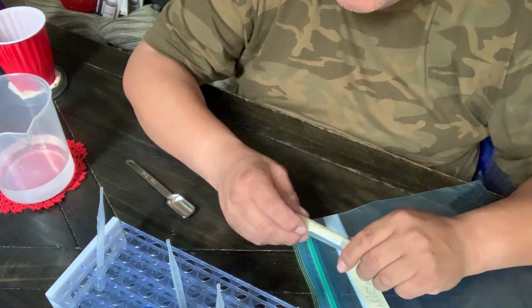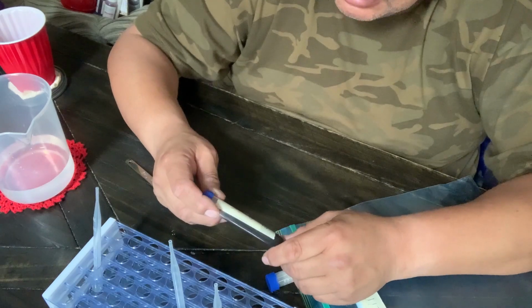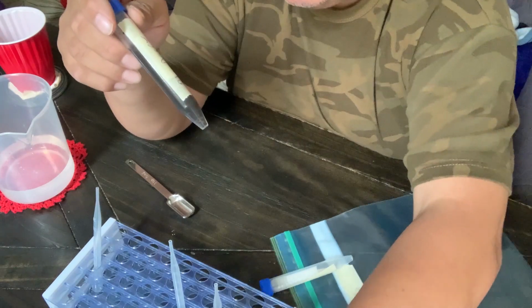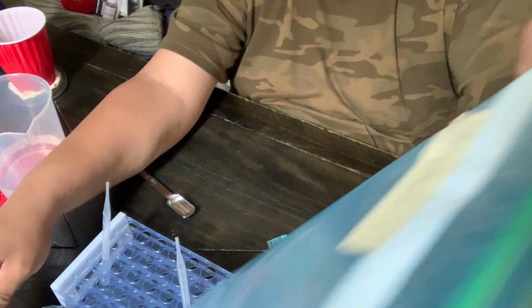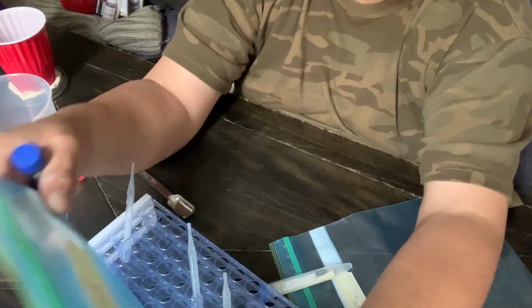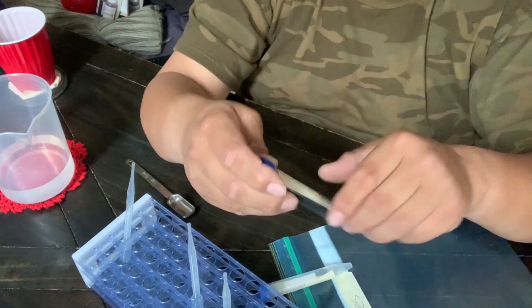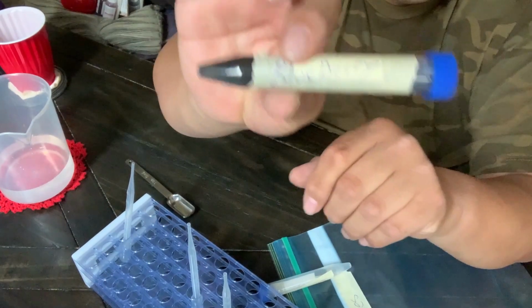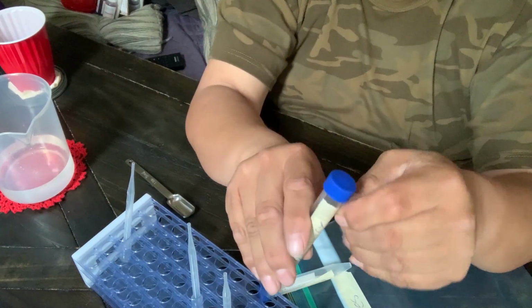Something's wrong. Okay, so you see, I grabbed the wrong bottle. This one says blueberries. And I know we did the grapes. Yep, we did the grapes. And this one says compost. And this one says blueberry, see? So how can you fix it? That's why you put the label with tape, and look how easy it is to fix.